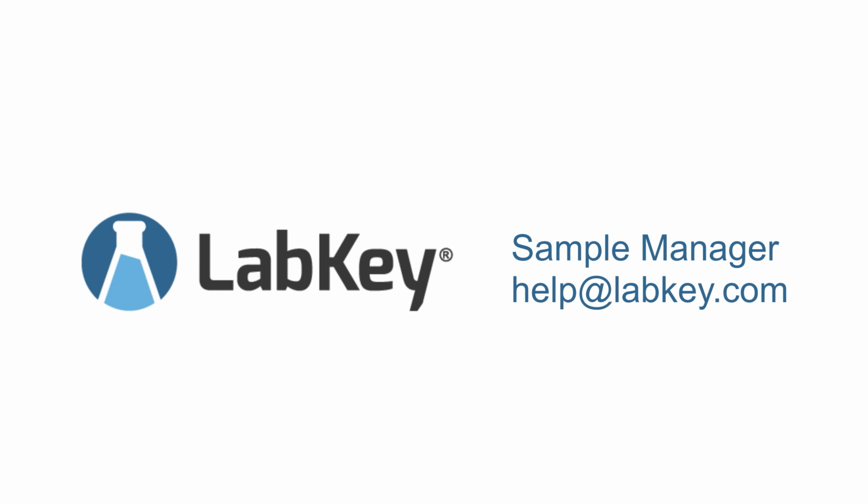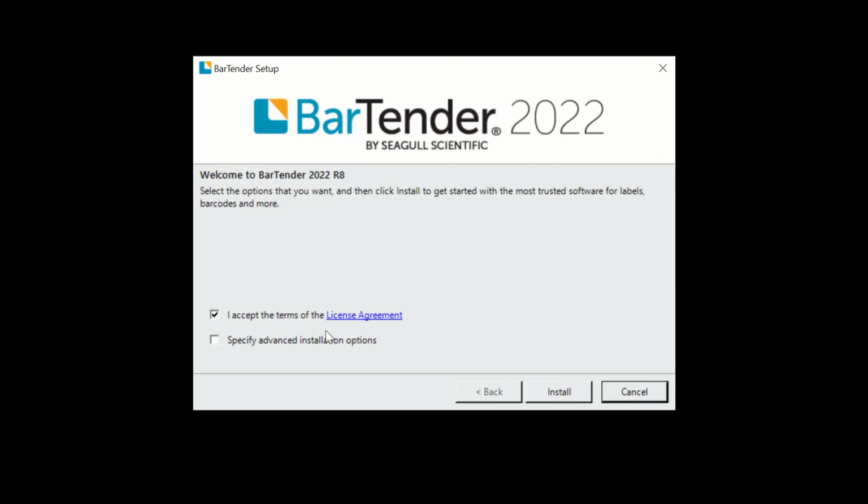Today I'm going to be walking you through how to download and install Bartender and integrate it directly with LabKey Sample Manager. First, you'll download Bartender and then follow the installation prompts. Select Specify Advanced Installation Options.